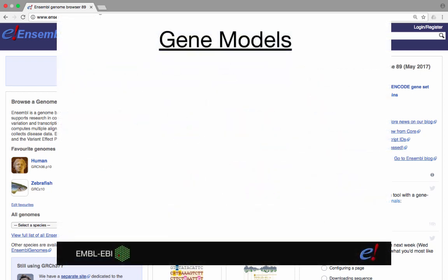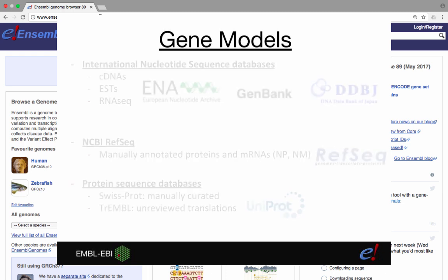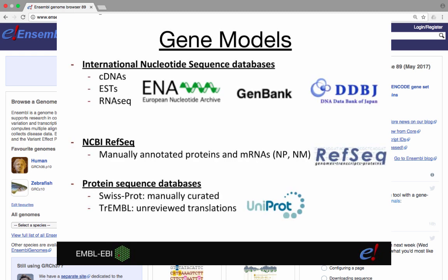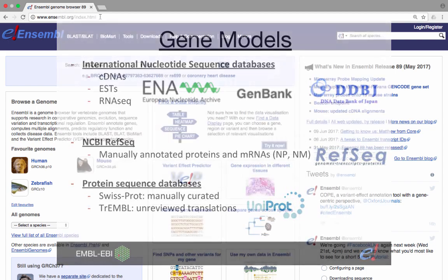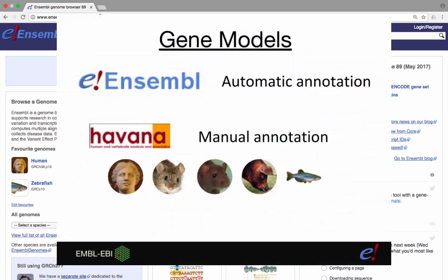For each species, Ensembl annotates a wide range of data onto the genome assembly. The first of these types of data is the gene models. For the prediction of gene models, called the GeneBuild, sequences from the International Nucleotide Sequence Databases, or INSDCs, NCBI RefSeq and UniProt are aligned to the genome. From these alignments, transcripts are then clustered together based on overlapping coding sequences to form Ensembl genes. This is called the automated gene annotation pipeline.